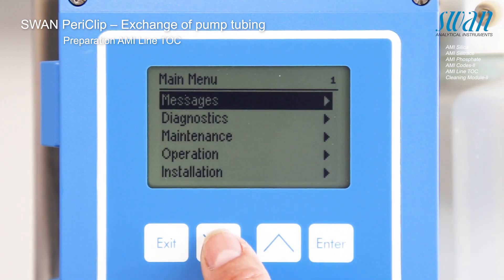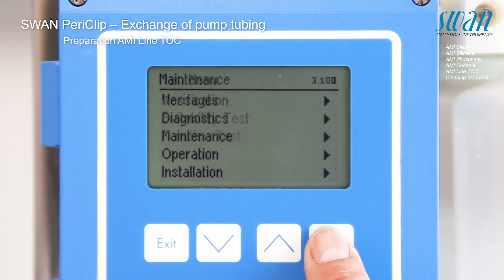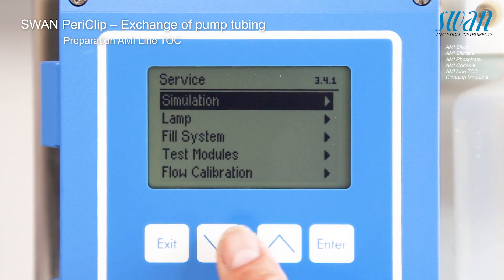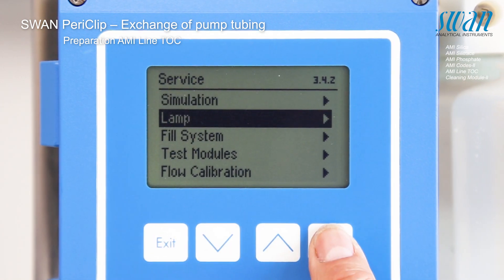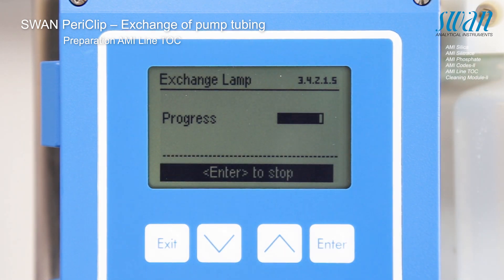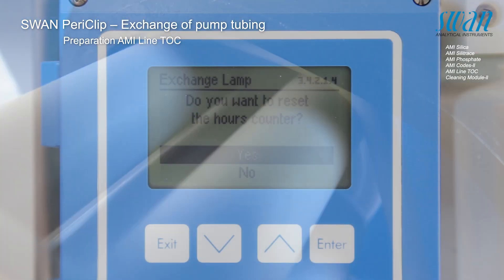Stop sample flow. The peristaltic pump runs in the reverse mode.